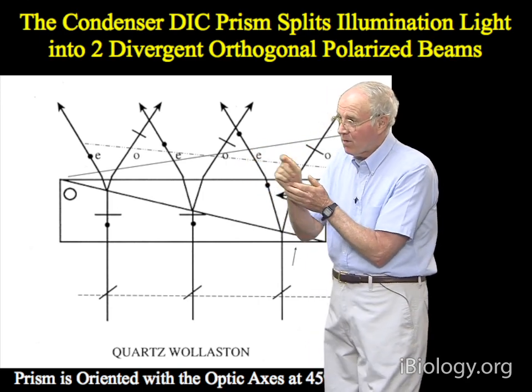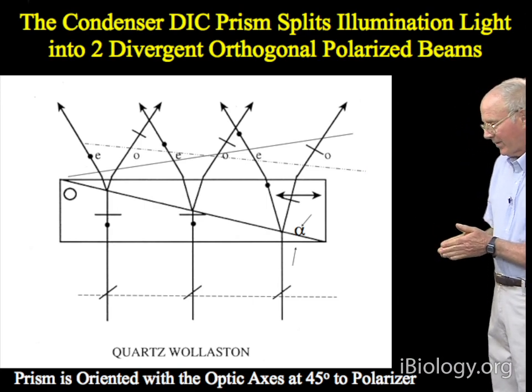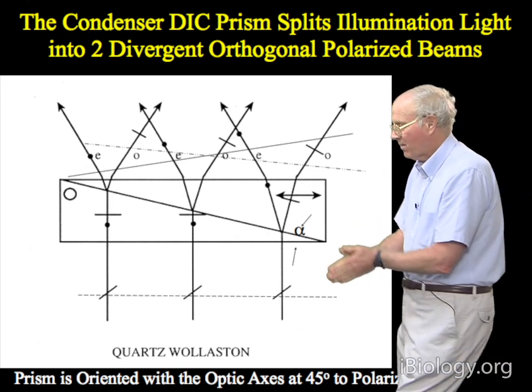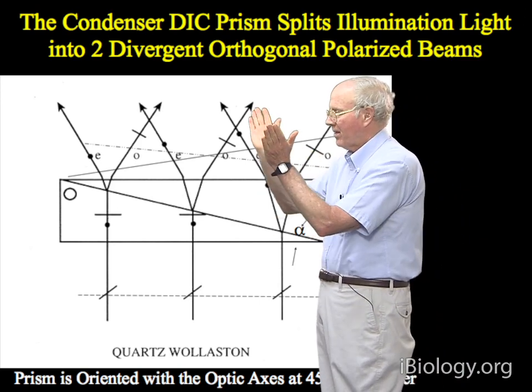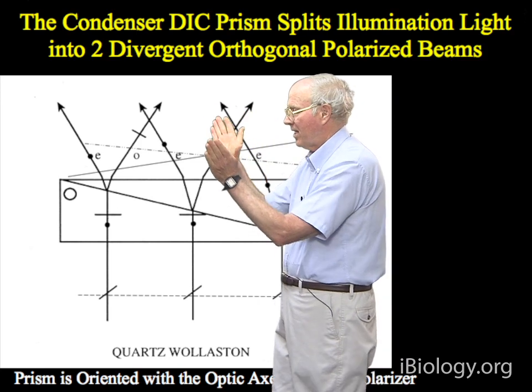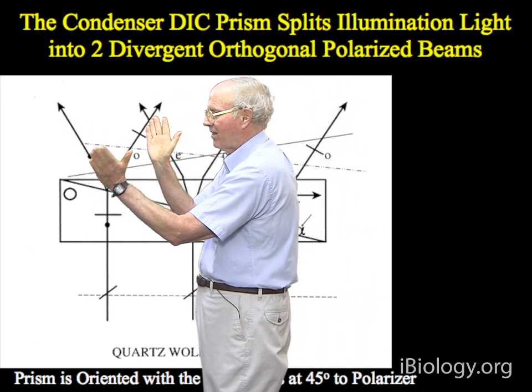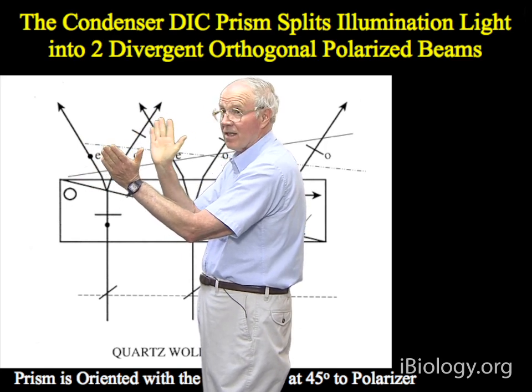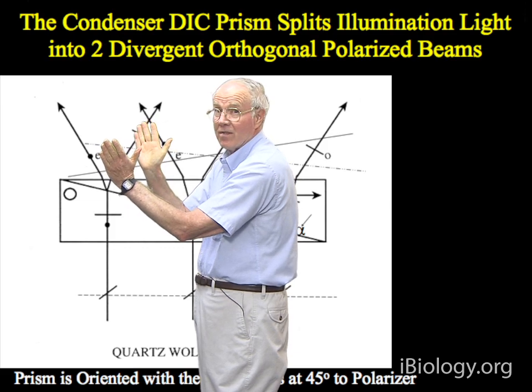And so for the bottom quartz wedge, if I start with plane polarized light, and I'm going through air, which has a low refractive index, and I hit the crystal, then once I'm in the crystal, the frequency of vibration is the same because it's transparent, but one wave goes slow and the other wave goes fast. The slow one has the higher refractive index, and the fast one has the smaller refractive index.